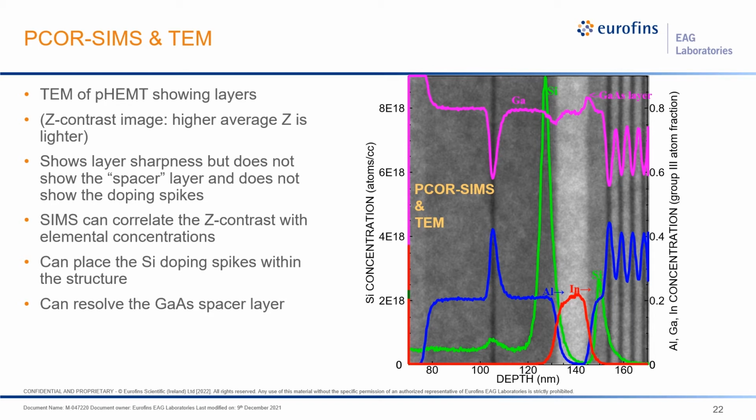In this particular case, we know that aluminum is causing a change in sputter rate from gallium arsenide into aluminum arsenide. In indium gallium arsenide, the sputter rate is actually increasing while AlGaAs is decreasing. So there's a big change from here to here, could be more than a factor of 2. But yet, the point-to-point corrected depth scale gives us a SIMS profile that matches the microscopy thicknesses, as is very clear here.